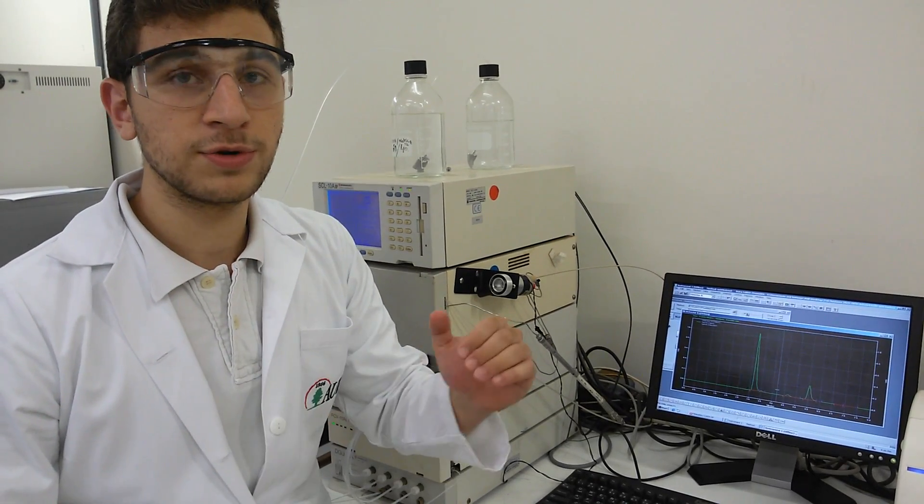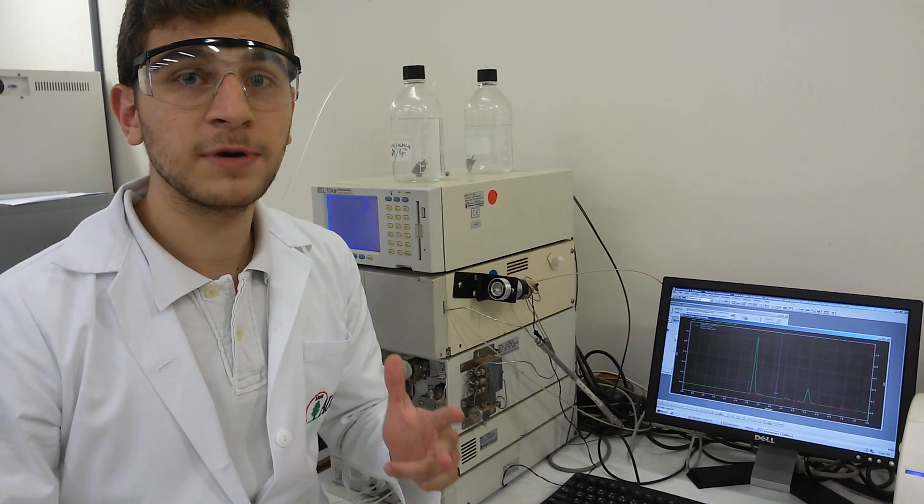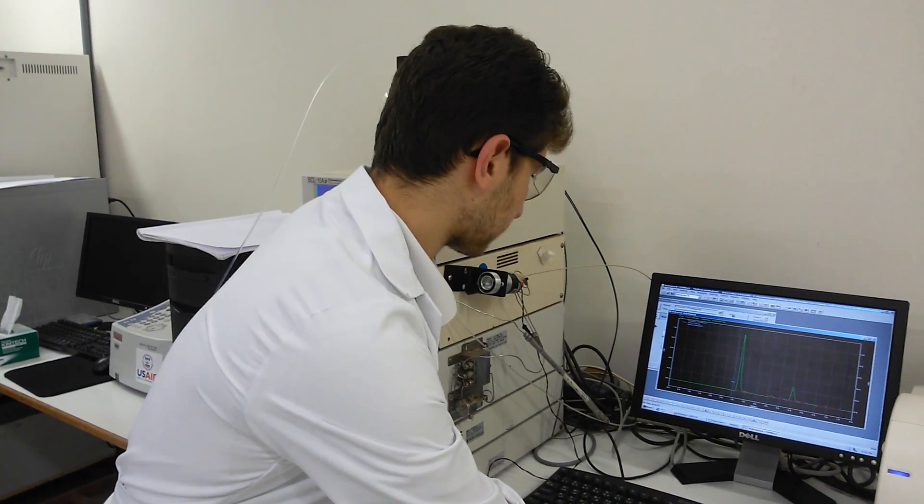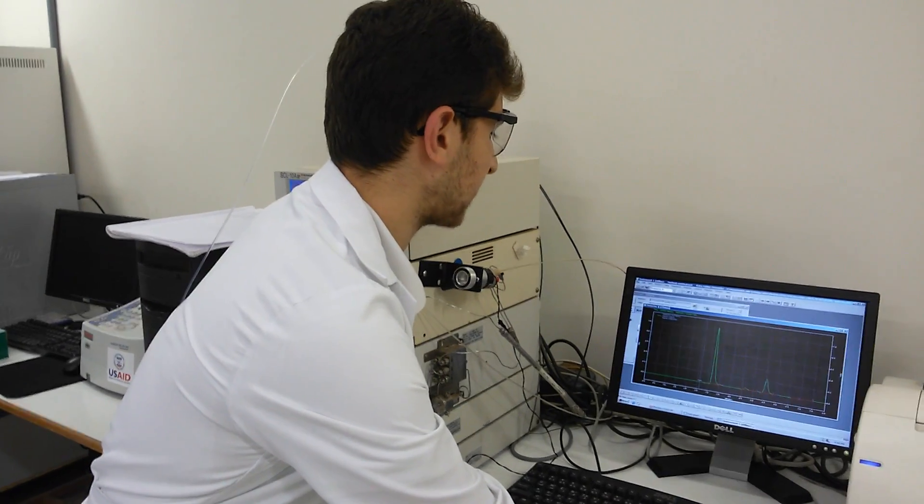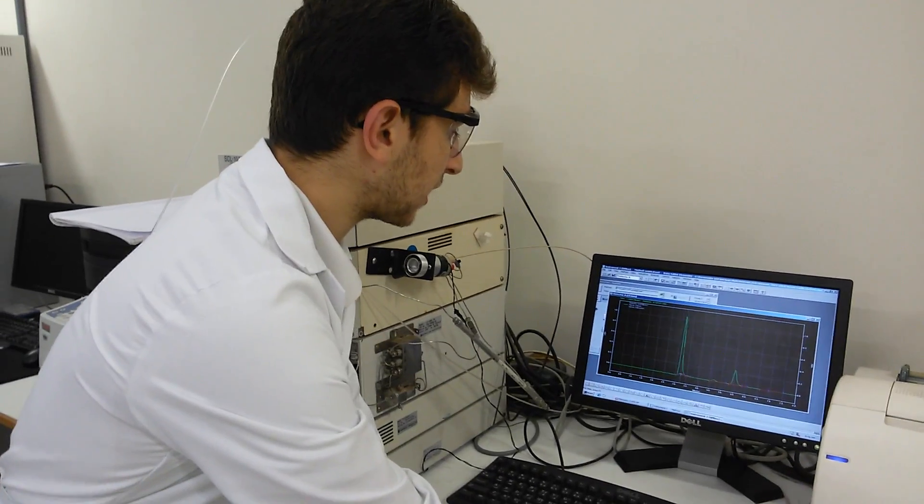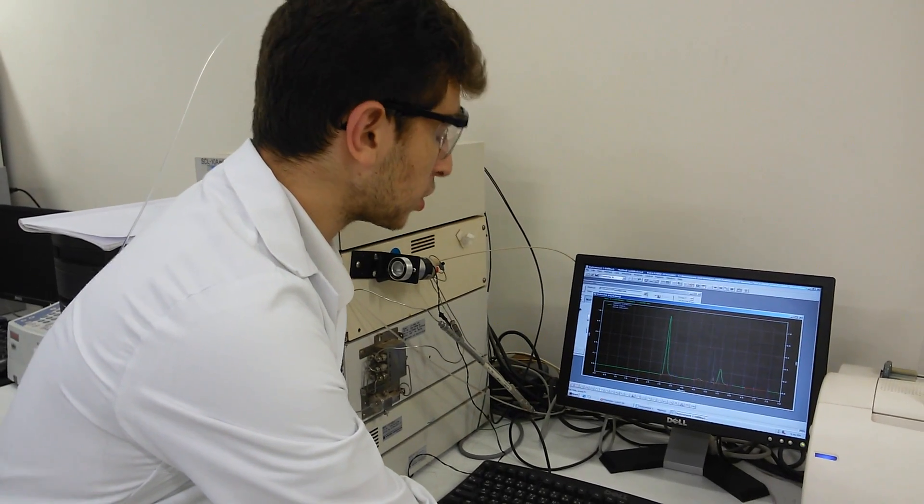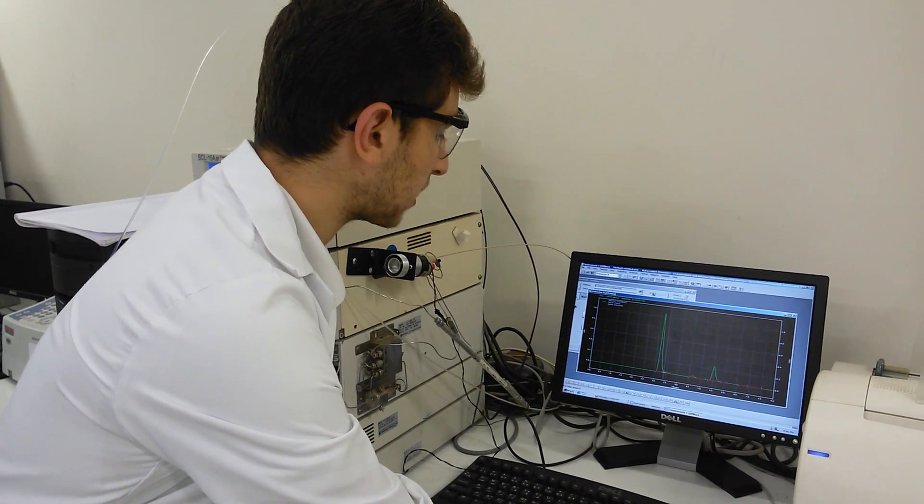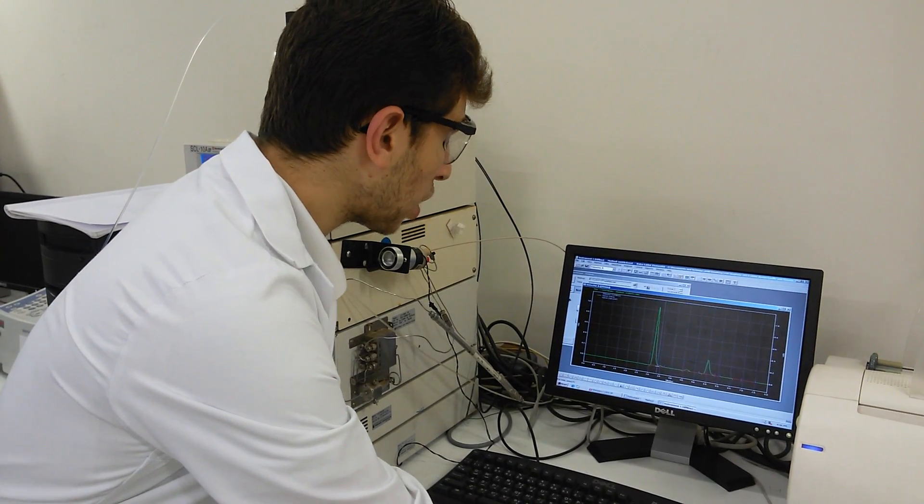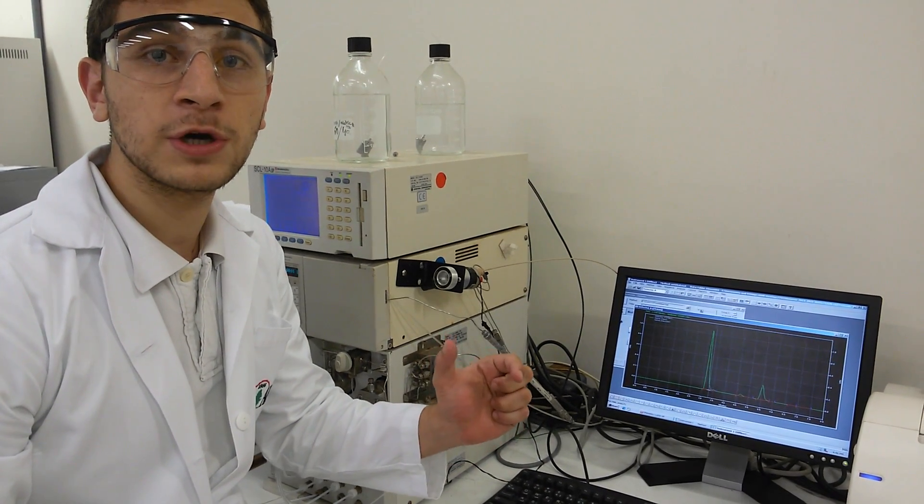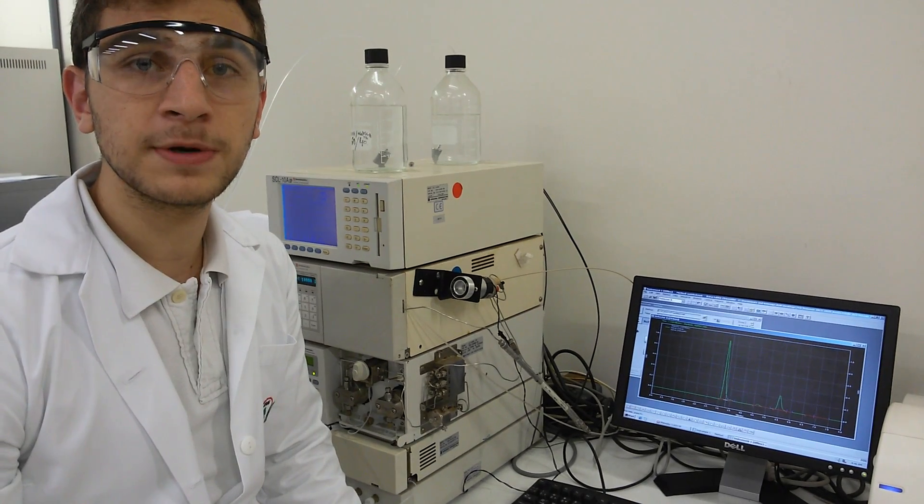After building our calibration curve by plotting the peak areas over the concentration, we get three calibration curves for every active ingredient. Now, we need to open, we need to see the signal of our tablet, we need to integrate for every peak area. For example, this, the first peak is for acetaminophen, we take the peak area and we plug it in the equation of the calibration curve of the acetaminophen. By this, we can get the concentration of the acetaminophen. We will do the same thing for the aspirin and the caffeine.